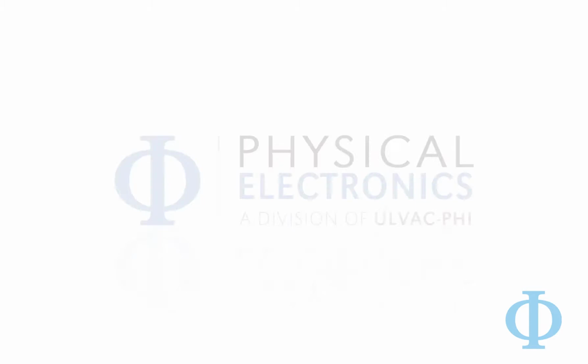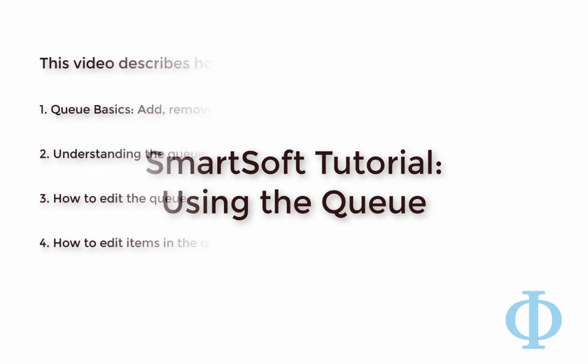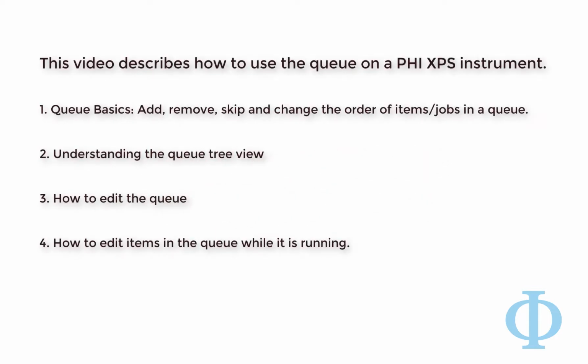This tutorial will show you how to use the queue functions in SmartSoft software. This video describes how to use the queue on a PHI XPS instrument. There are 4 sections to this tutorial.